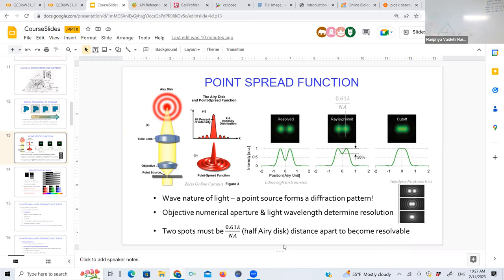Let me redraw, sorry, and then it will become a bit clearer. So I'm going to focus something like this. And think about it, all of this light over here, I'm not collecting. I'm collecting a very small angle of light. Whereas when I focus here, okay, I'm leaving out some light, but I'm collecting a much bigger fraction of the light, much bigger angle. So this is clearly better than this because I'm picking up more light.